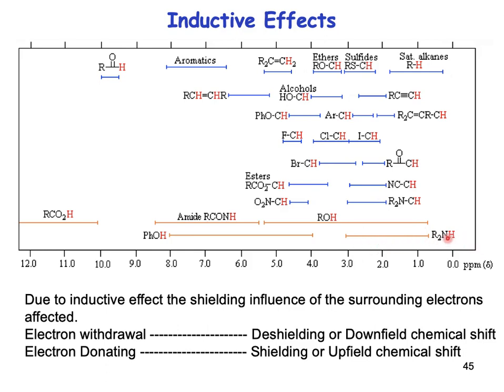So this one is an electron donating group, which always comes at shielded region. You can see once the proton is attached with oxygen and phenolic group, it has a de-shielded environment, since these groups have electron withdrawal effect as compared to the amino group. That's why it comes at de-shielded high frequency region.